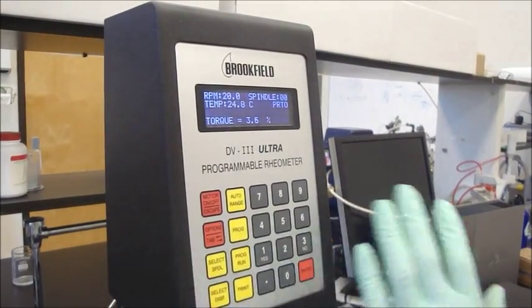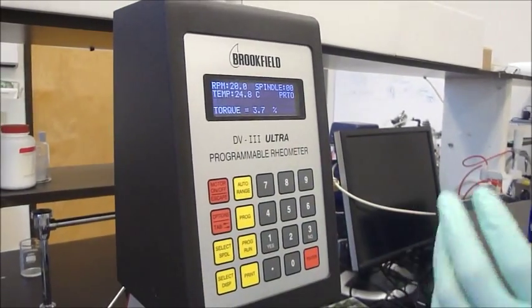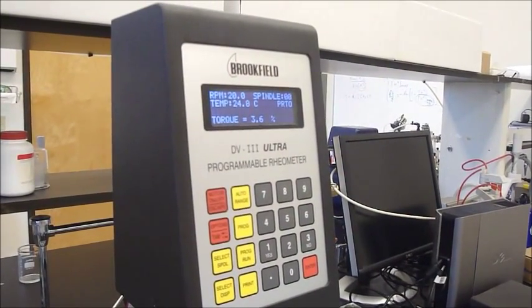And repeat this procedure until the RPM is 200. And then you can switch to another sample. Thank you.